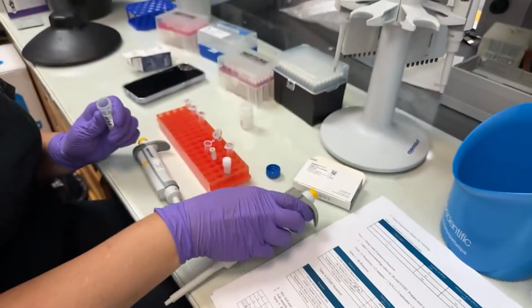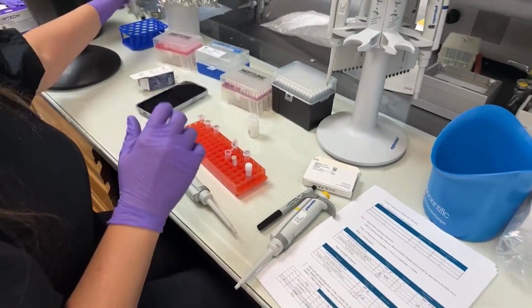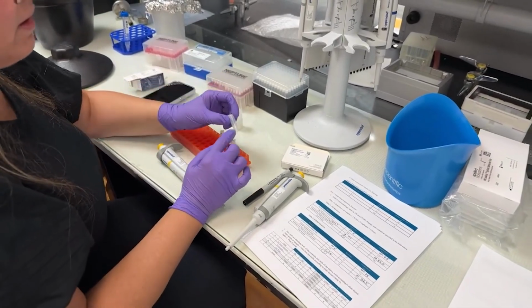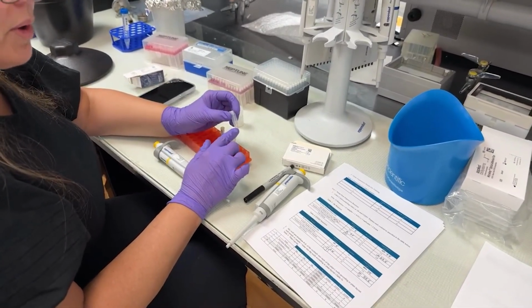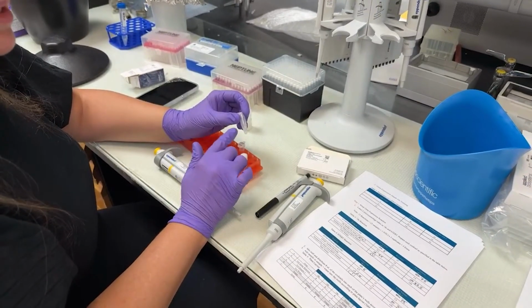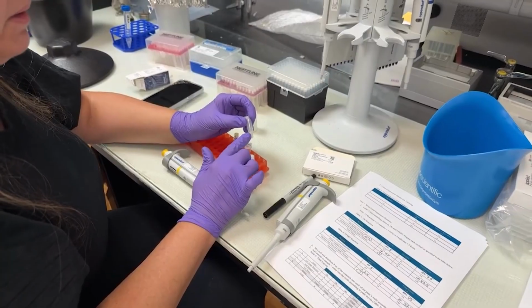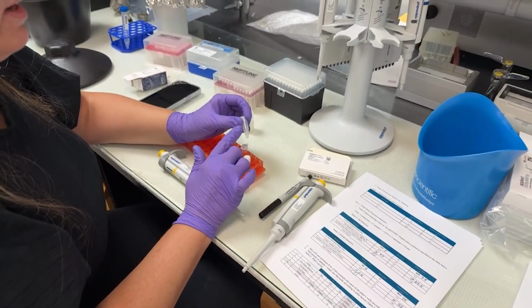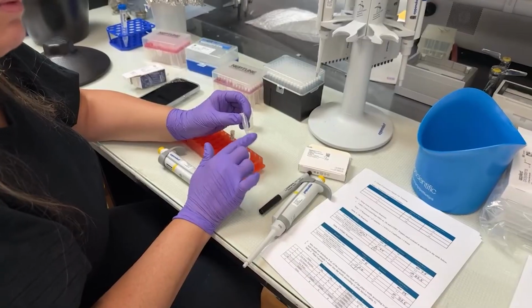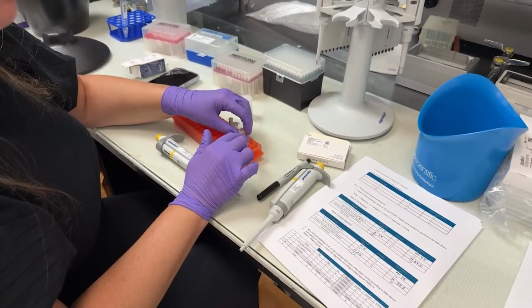We dispense our 37.5 microliters of water. And now these are all of the primer, probe, water and enzyme, NTPs, and everything we're going to need for our individual reactions in bulk. We will then mix this and aliquot it into the plate when it's time for that, and then I'm going to add our samples to it.